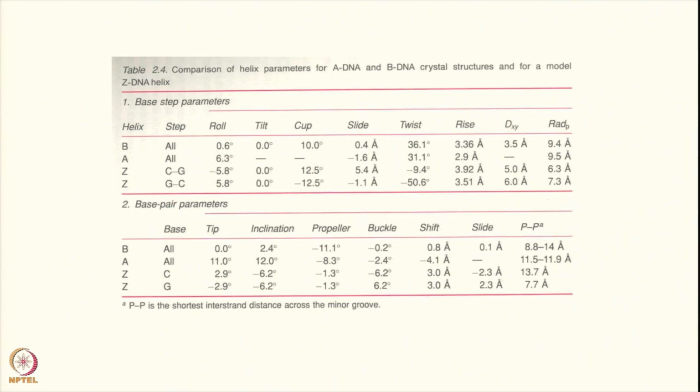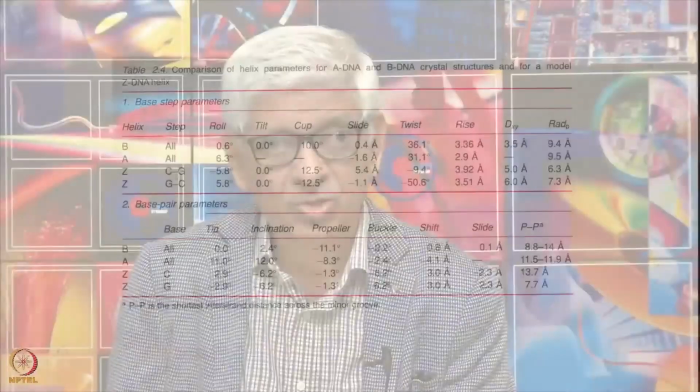So in other words, we need to characterize this kind of detail for the structure when we want to calculate the structures of the molecules, and crystallography has been used and NMR also has been used, and we will see more of what kind of structures have been determined by the NMR data, and these happen in the solution. So this has become possible with various kinds of NMR experiments and certain algorithms which have been developed. So I think we can stop here.